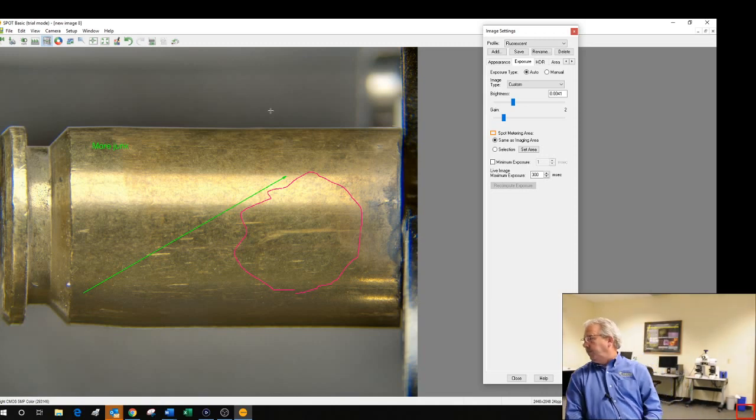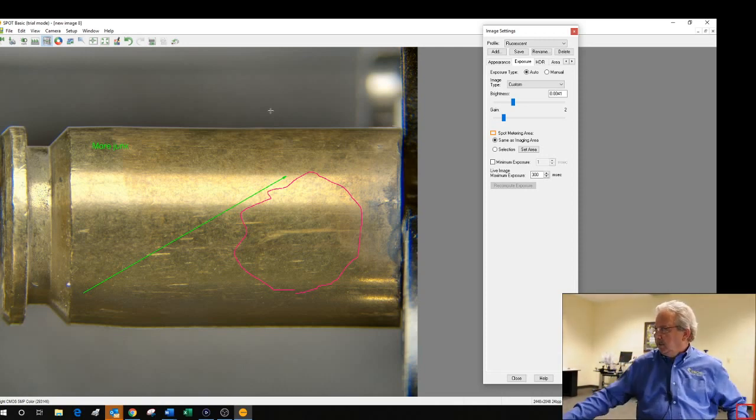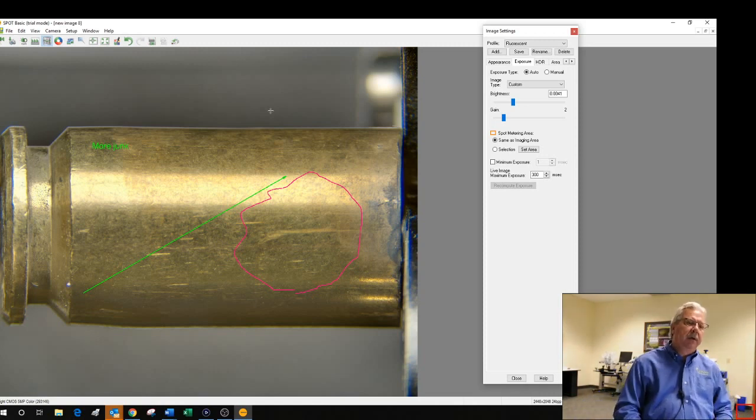Got one issue from Michael. The issue I have every so often is that "image too dim" when I start up the Spot software, with the exception of HDR. Sorry, I'm riding over my microphone cable, forgive me. Michael, the image too dim could be a result of several things.